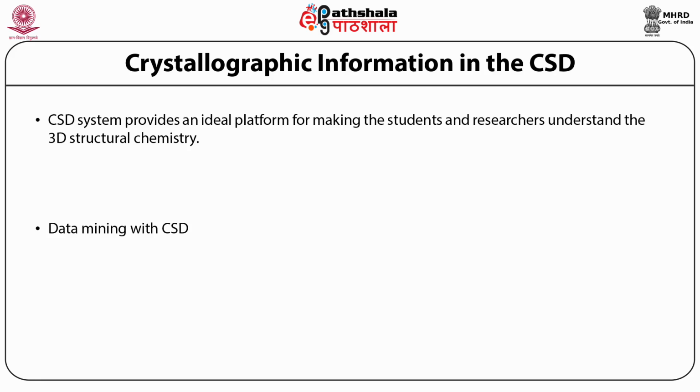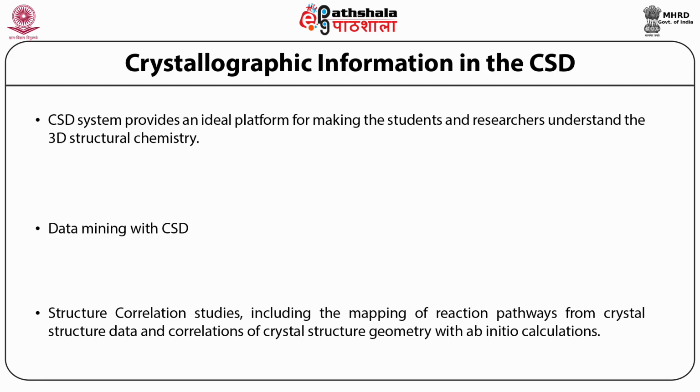CSD analyses are very important in structure correlation studies that include the mapping of reaction pathways from crystal structure data and correlations of crystal structure geometry with ab initio calculations. The validated and curated CSD files can be exported into a wide range of formats.